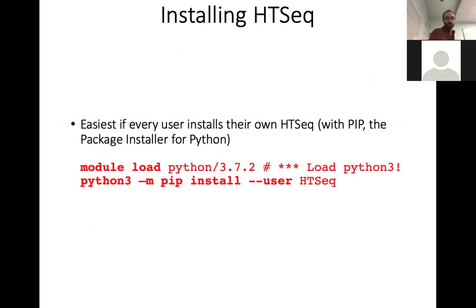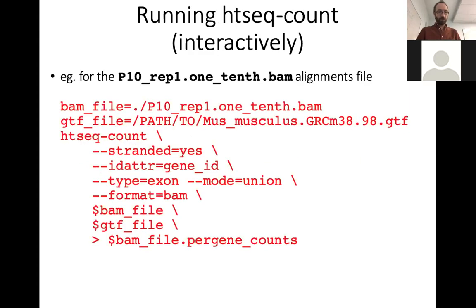Okay, so this is the command. I'm going to fix it right now. Remove that weird non-standard hyphen that Word has put there. It's not in the PDF, but this is fixed. In the next page, you have path. What does path stand for? Oh, path to. You're meant to replace this with the actual path to the file.